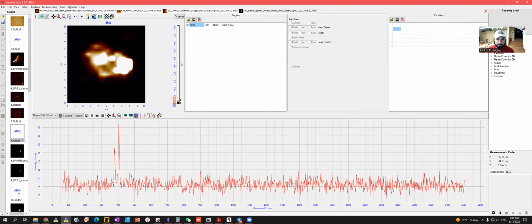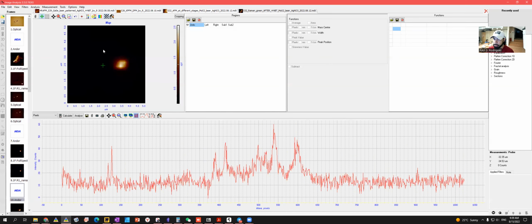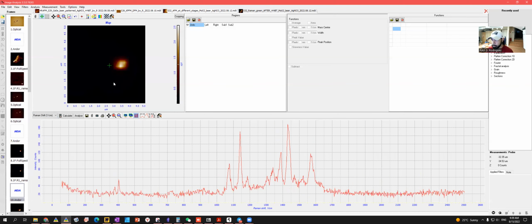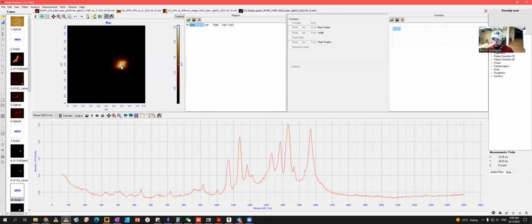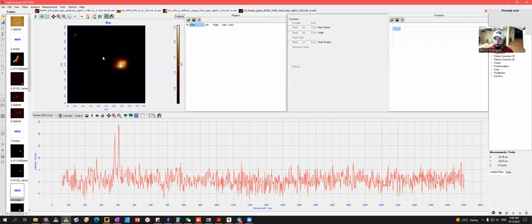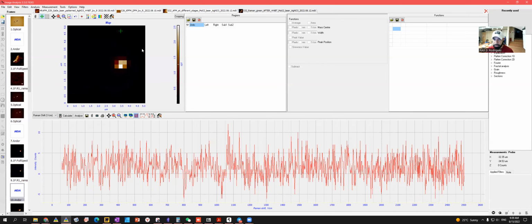Yeah, I could do this one first. Unfortunately, this Russian software is a headache to work with. It gives tons of errors. When it works, it's a 50-50 chance that it's going to work. Okay, what I'm going to do. I know what is a molecule. So a Raman map consists of different pixels, and the spectra is measured at different pixels.